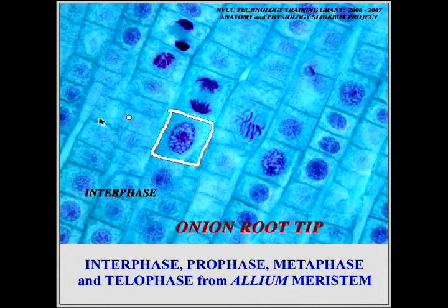Anyway, my point here is that this area is a nucleus, and you can look very closely. It's starting to break down. And that purple area in the middle is the beginning of the condensation of the chromatin, where you will eventually see the chromosomes appear. You don't see that in these other cells down here, do you? Okay, so eventually the chromosomes will appear, and they will obviously be duplicated.